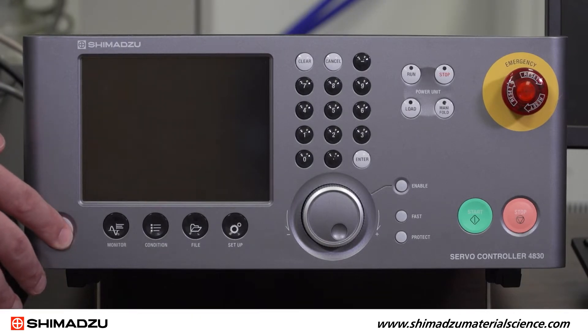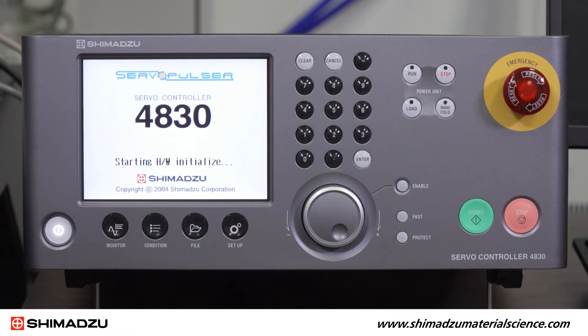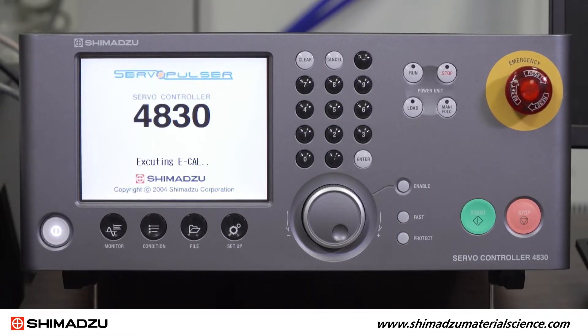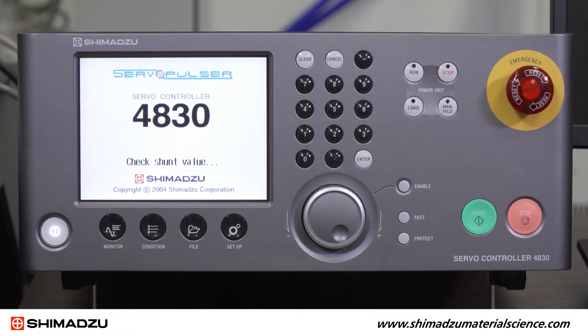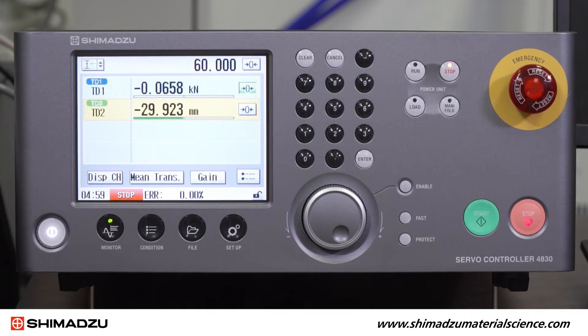Next, power on the 4830 controller. It will take a moment to initialize. Once initialization is finished, you will see a screen showing the real-time transducer values.